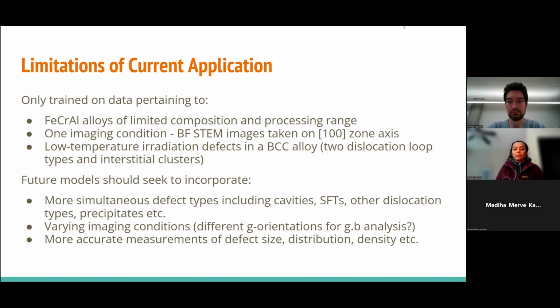Yeah. So in this paper, they presented a comparison with the UNet, and you mentioned that Mask R-CNN is superior to UNet in many ways. So in what way is it superior? I know that UNet does semantic segmentation, and Mask R-CNN does instance segmentation. Apart from that, why do you think it's superior?